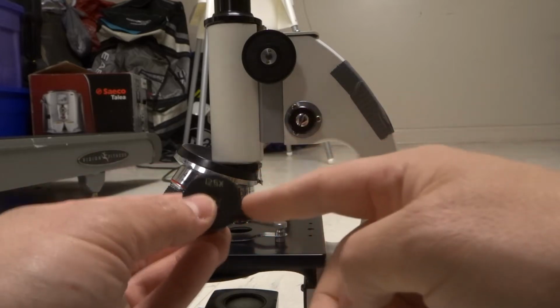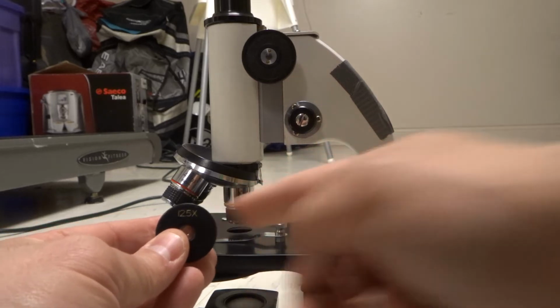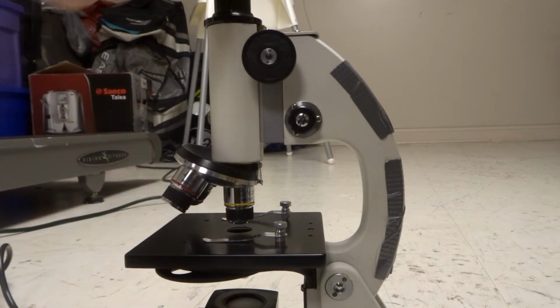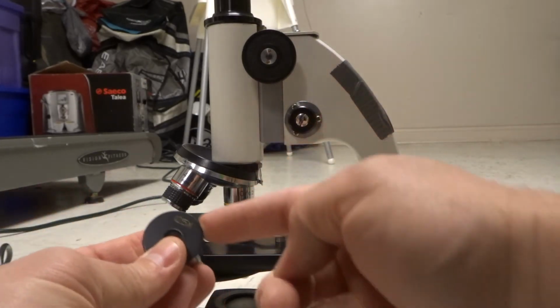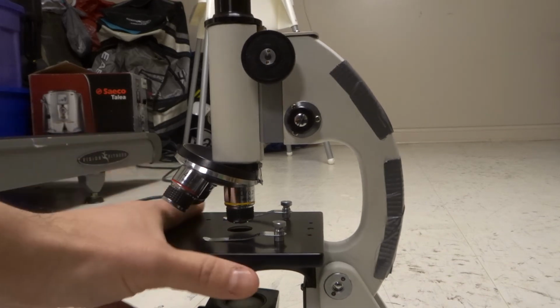So if I use this combination of this ocular lens and this objective lens, 10 times and 12.5 times, I'm going to get 125 times magnification. And essentially, that's how to calculate the magnification of a microscope. You take your two magnifiers and you multiply them together. If you only have one, then just read it and it's done for you. But if you have two, which most likely you're going to, then you have to multiply them together, and that's how to do it. It's as simple as that.